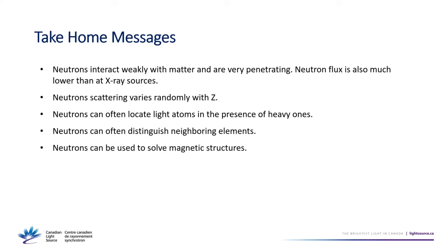So yesterday for PDF, you said that with X-rays you get to 25 or 30 Qmax. How is it for neutrons? So for neutron PDF, you can usually go out to higher Q. Usually about 30, 35 is pretty typical. And that's largely due to the fact that you don't have a form factor. You're blowing up that high Q region by multiplying by Q and dividing by the form factor with X-rays. With neutrons, you don't have to divide by a form factor, so you get better intensity out there. And so it's easier to get the statistics you need, despite the fact you have lower flux.